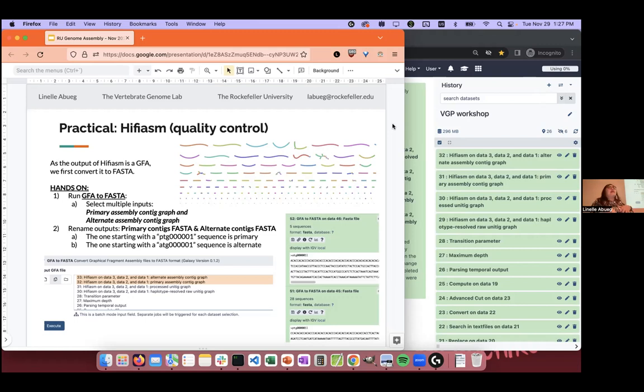And then we're going to take care of that later with purge dups, because that gives us a little more control over thresholds and where we want to call a duplication. That's the main difference. If you leave it on, it'll just try and do its best, but it was not super good for a while, so we stayed with doing it separately.